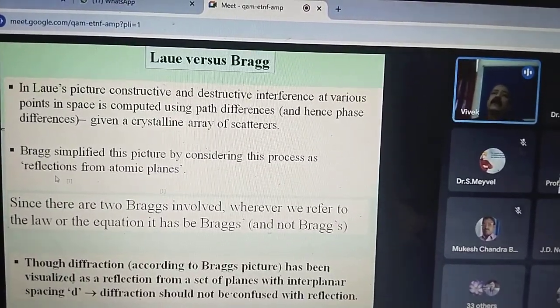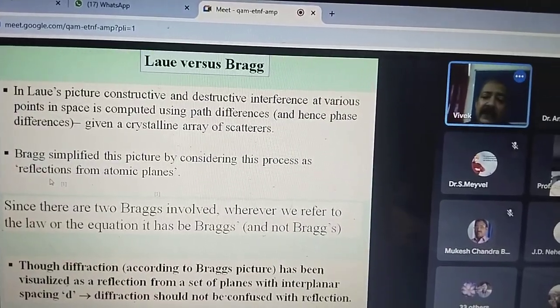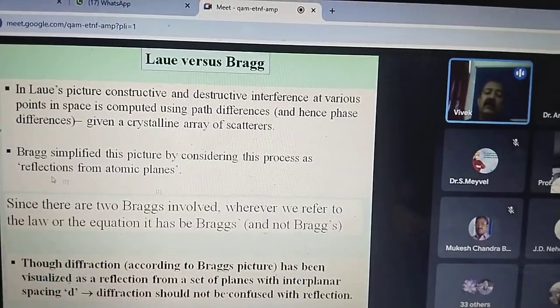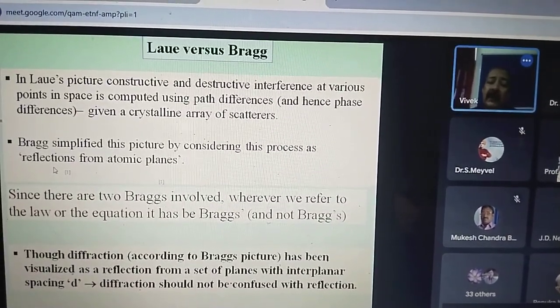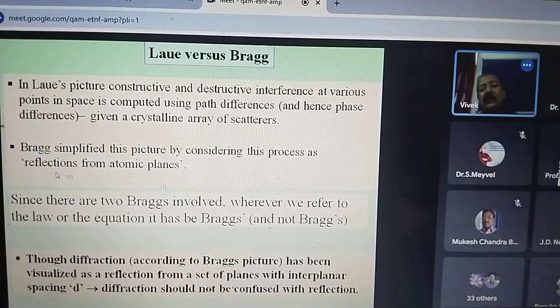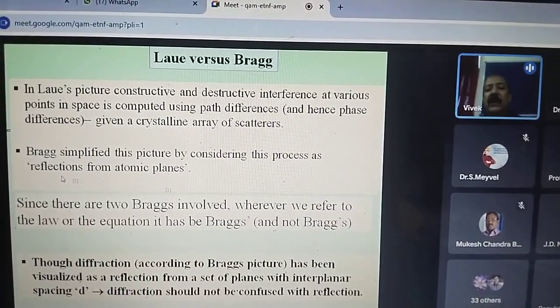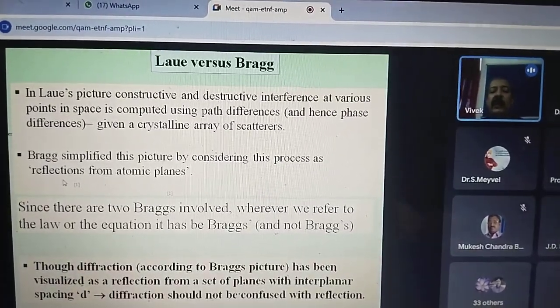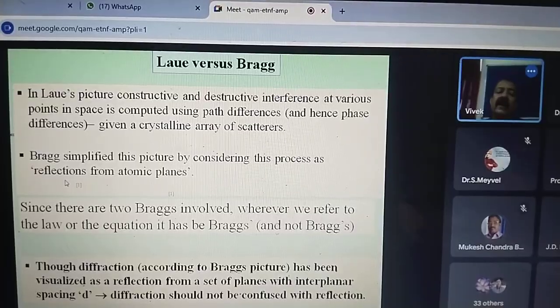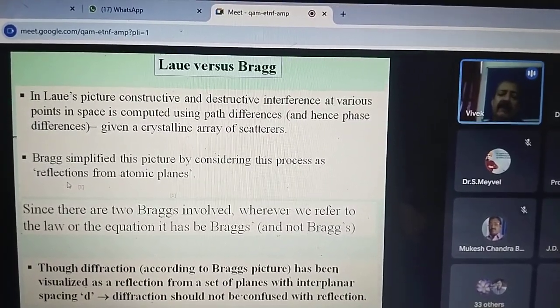So your aim is to find out the crystal structure. Our first aim is to find out the unit cell. Once you have the unit cell parameters in your hand, then you can decide what your crystal system is. Your crystal system depends upon the A, B, C, alpha, beta, gamma values. Once you have all these 6 values, your work is reduced to one out of the 7.